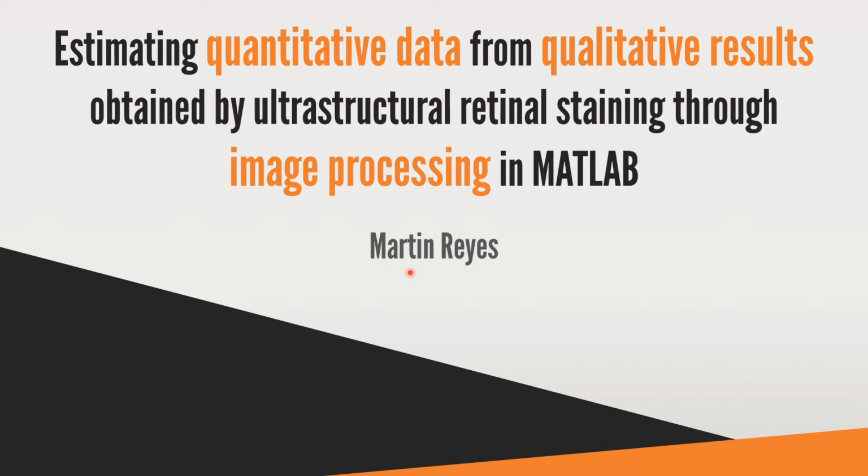Hello, I'm Martin Reyes, and today I'm going to be talking to you about estimating quantitative data from qualitative results obtained by ultrastructural retinal staining through image processing in MATLAB. That's kind of a mouthful of a title, but we're going to walk through this presentation and talk about this code that I developed.